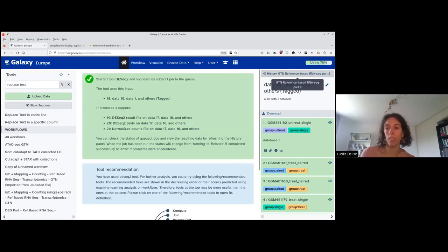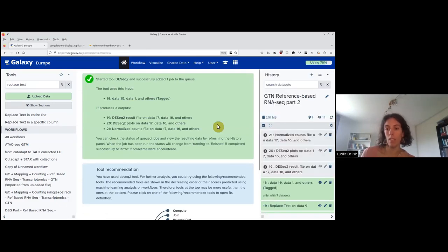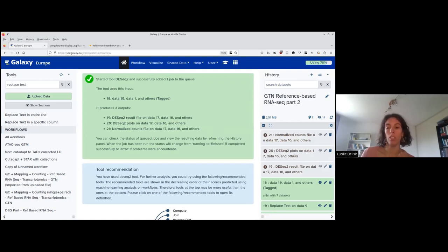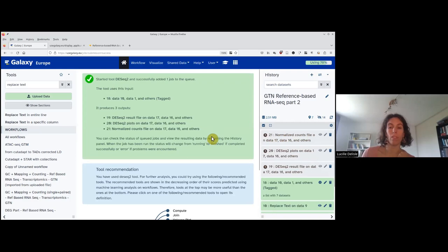I run the tool. I go back to my history and I see that there will be three outputs: one which is normalized counts (a big table with all the counts), then there will be some plots, and finally the result file, which is a table that will tell me for each gene the log two-fold change, the p-value, and the adjusted p-value. I pause the video here and come back when it's done.